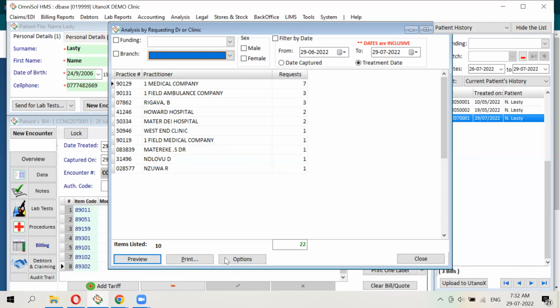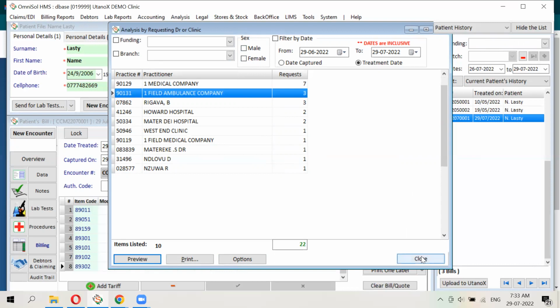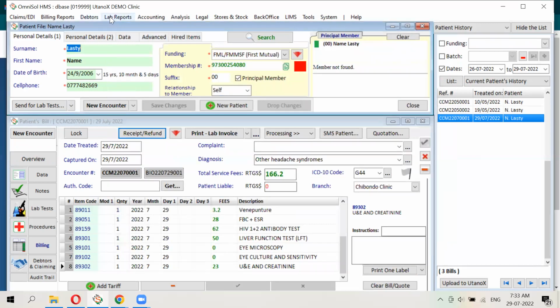Okay. Will it be able to show me how much money we were expecting from, let's say, a particular doctor? Just an overview to say, okay, fine, we have doctors who are here. We had 1 request this month, let's say. Is there a total? Can it fish that total? Right.